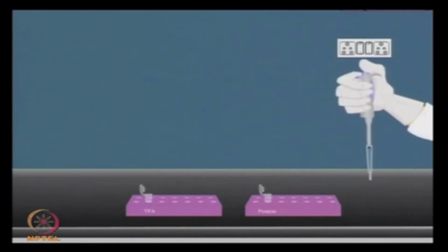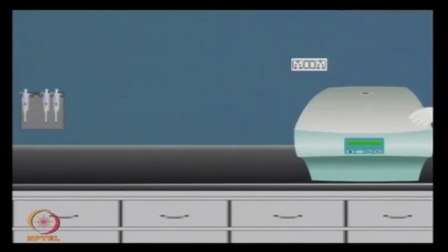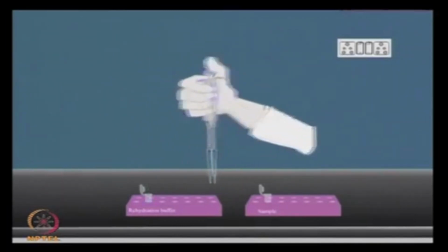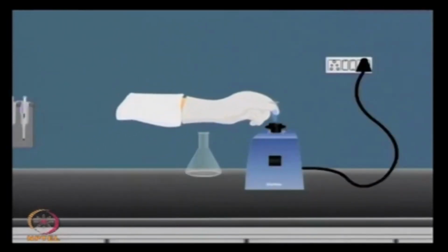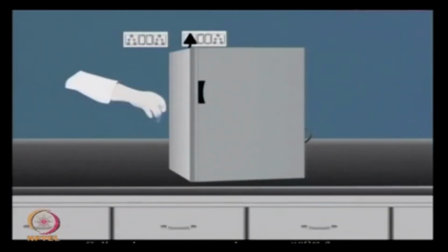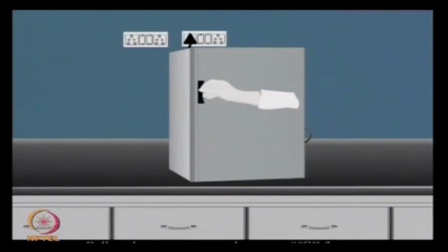Once the serum has been processed using a depletion column, precipitate out the remaining proteins by using trichloroacetic acid and acetone. Once the protein extraction is done, then we need to add the rehydration buffer, which contains urea, thiourea, CHAPS, DTT and BPB. After overnight incubation, we can centrifuge and collect the supernatant.